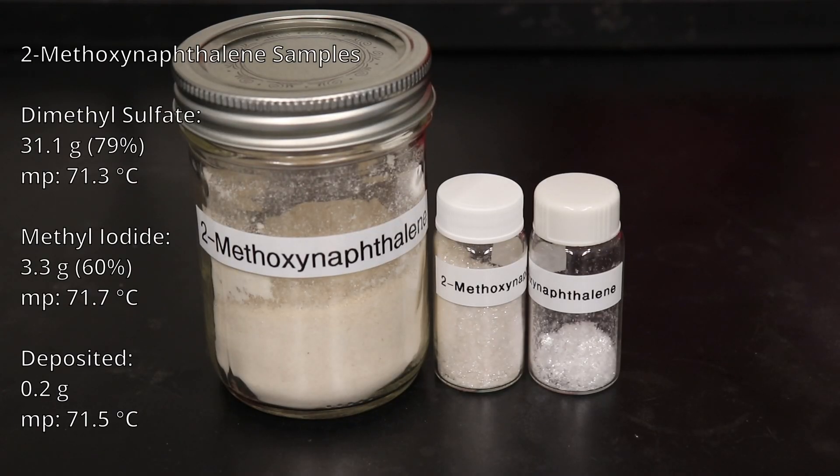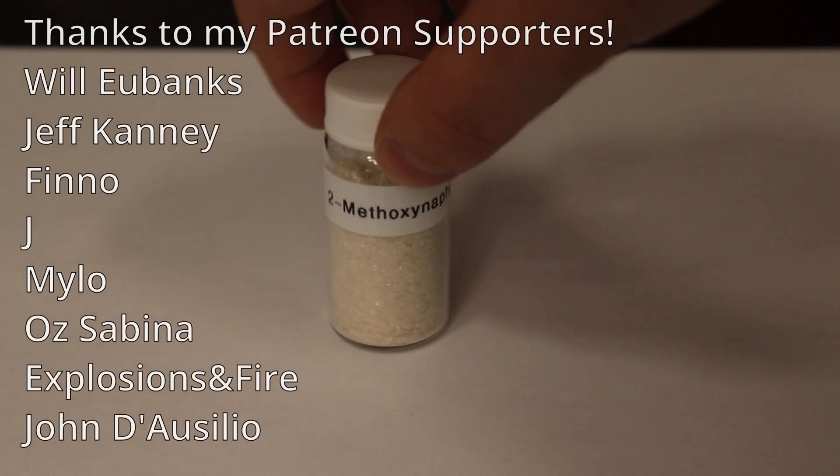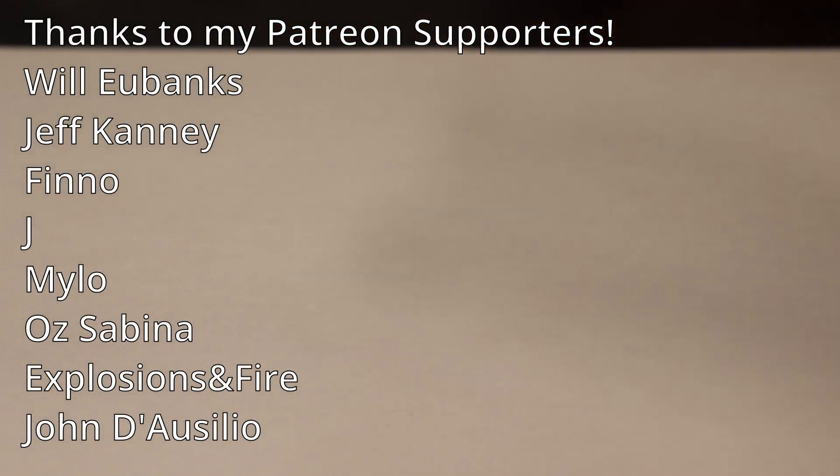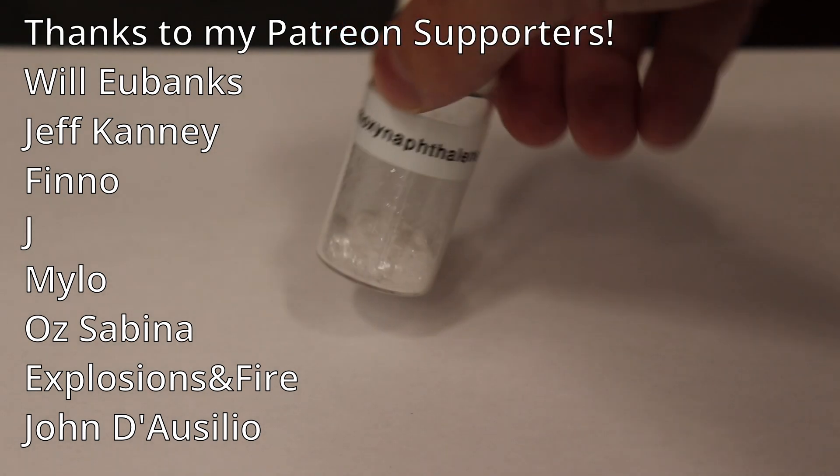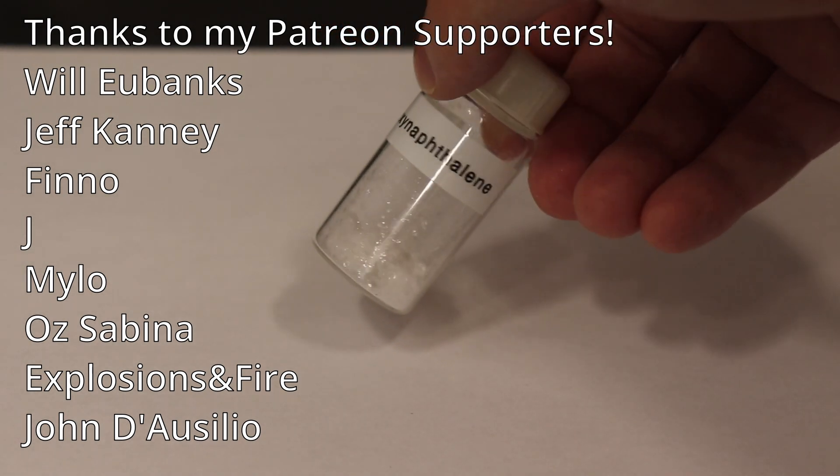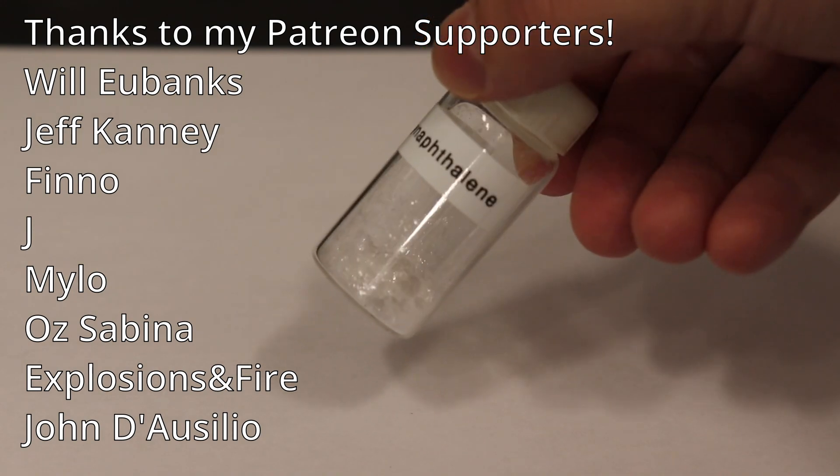Now we can recap our syntheses. The larger scale dimethyl sulfate preparation yielded 79% of 2-methoxynaphthalene, while the smaller scale methyl iodide methylation only yielded 60% of 2-methoxynaphthalene. We can see from the rightmost deposited 2-methoxynaphthalene that it is pure white, and comparing to the other two samples, which are slightly off-white, that might indicate the presence of a slight impurity in those samples. But since all the melting points are within 1 degree of each other and of the literature, we can be sure that our product is pure enough for moving forwards with future syntheses.